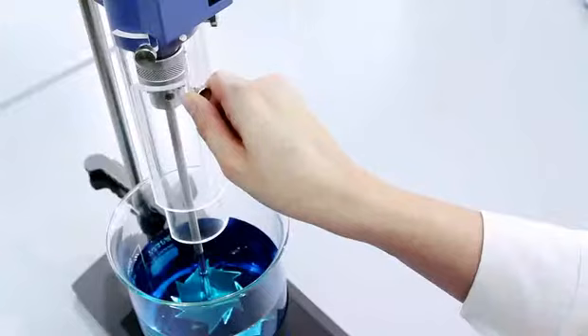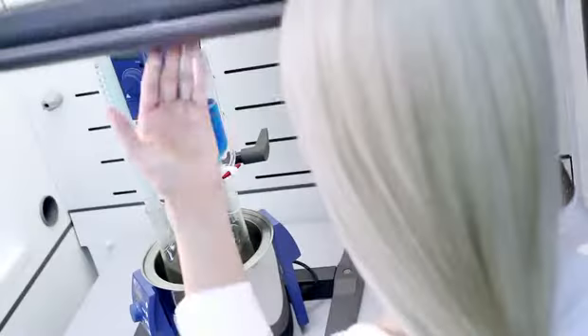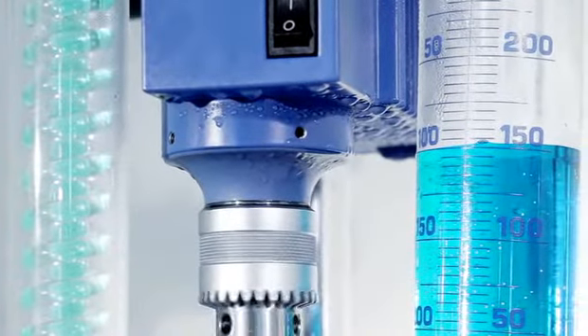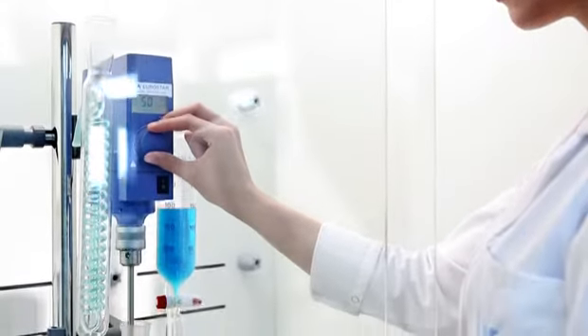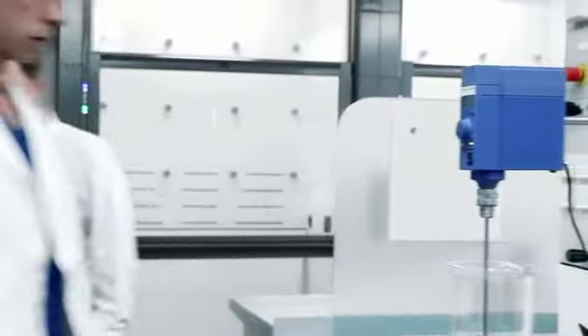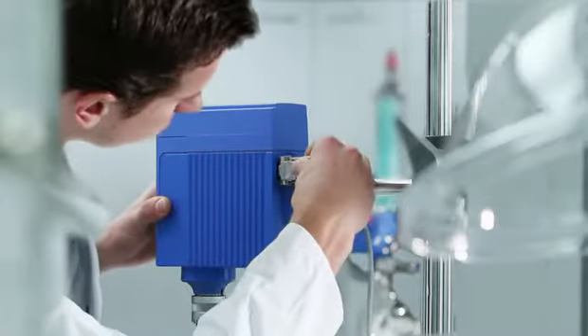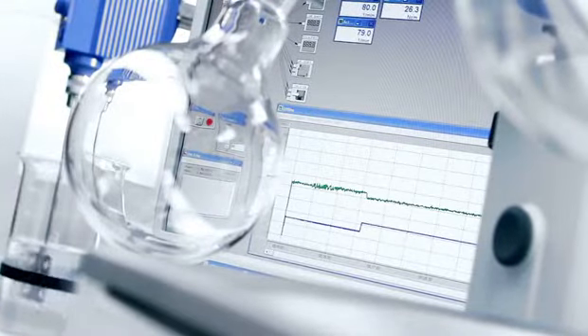Stirring shaft protection, available for all units. Integrated torque trend display. IP42 compliant housing reliably protects your unit. Modern ergonomic design, space saving and efficient. RS-232 interface enables PC control — ideal for monitoring and documentation with LabWorldSoft.